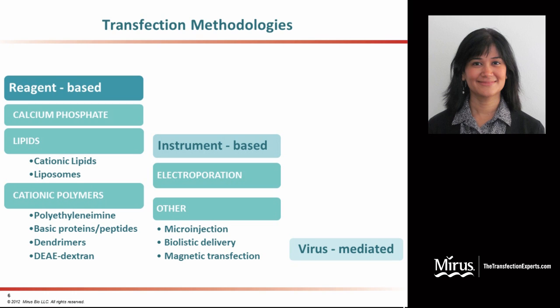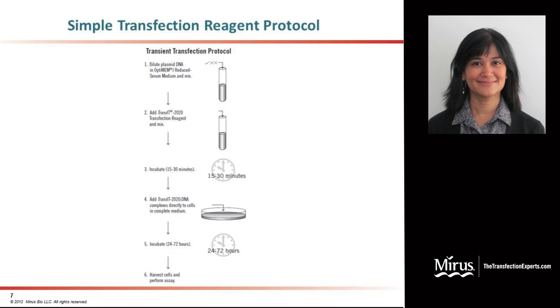Some researchers also refer to virus-mediated techniques as transfection. The reason that reagent-based methodologies are most popular among scientists lies in the simplicity of the transfection protocol using reagents. Here is a schematic to illustrate the simplicity of these transfection protocols.